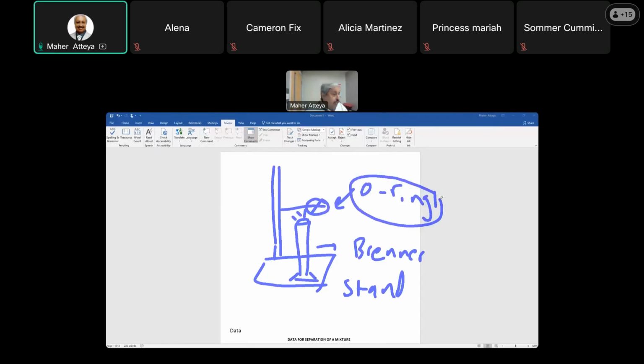Okay, to support this crucible, we will have to have a triangle. You'll have a clay triangle, ceramic, to put your weighing dish number one with your mixture. That's dish one, okay? You will heat this one here first.